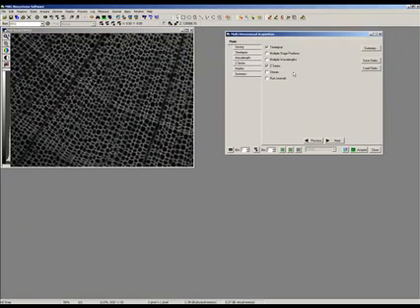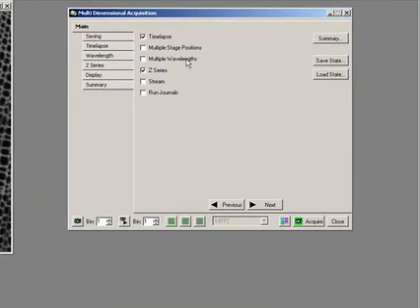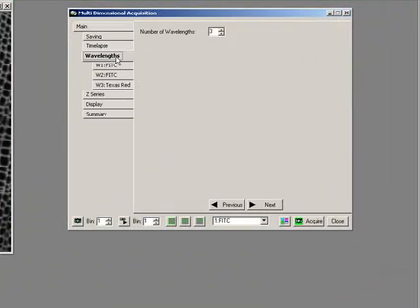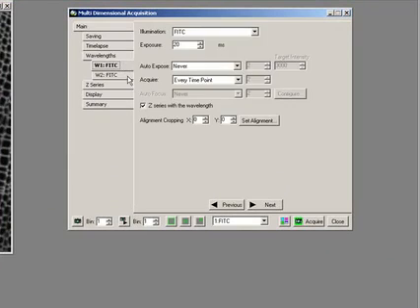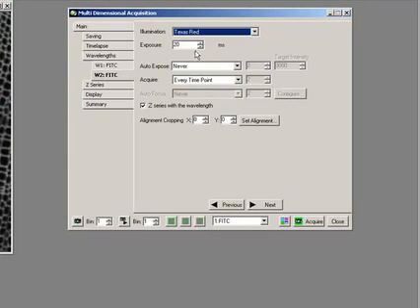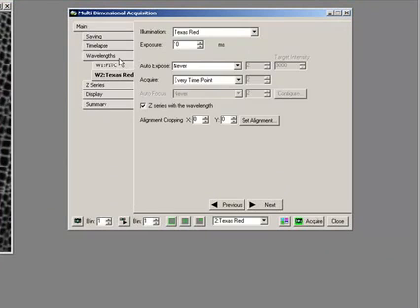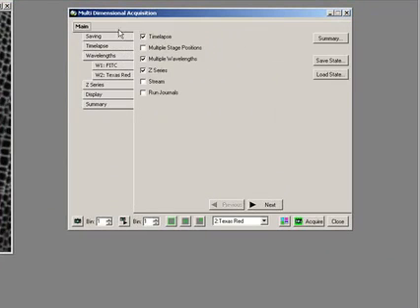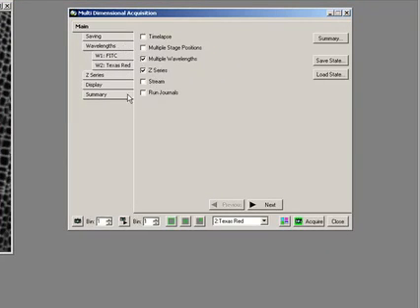If I wanted to do that with multiple channels, I would just click multiple channels, and again set up my wavelengths correctly, so channel 1 FITC, channel 2, I'll have Texas red and we'll make it darker. And then we'll turn off time-lapse for the moment, just because we're just going to want to do multi-wavelength and Z series.